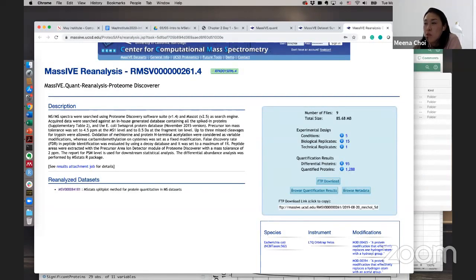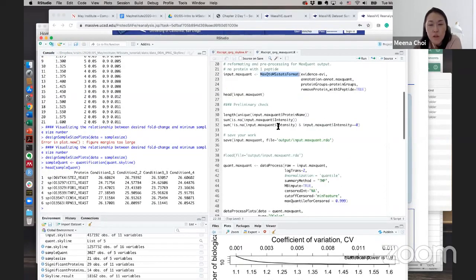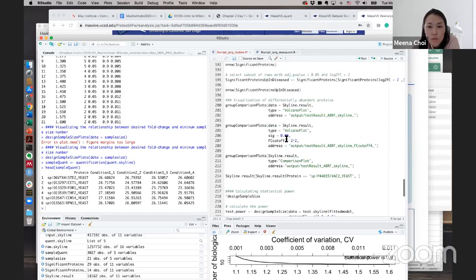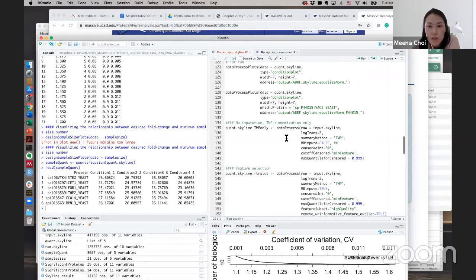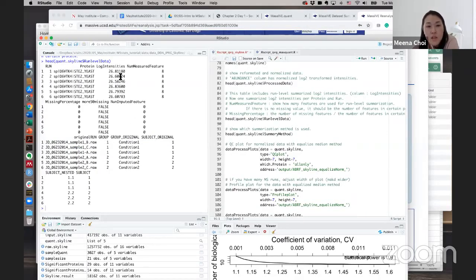Can you report the number of unique peptides used for quantification of each protein and protein group? Yes, we can update this. Currently, if you go back to our run-level quantification, we will think a little more about how we can report this more accurately. Here is the run-level data. For each run and each protein, we say we use 8 features, and our default is always to use the unique peptides, so it should be the unique number. But yes, we can label it more accurately.